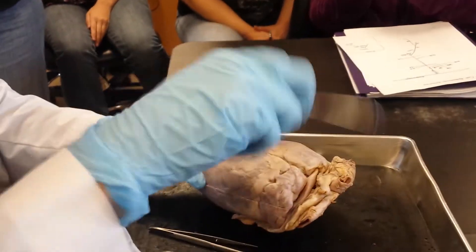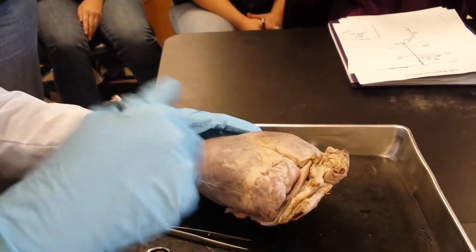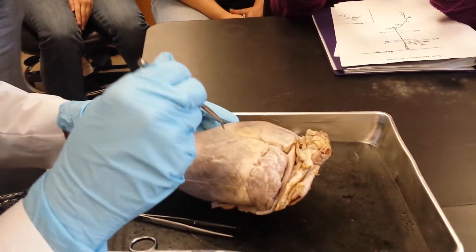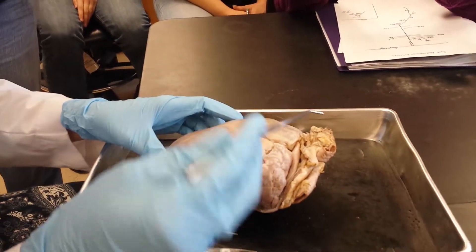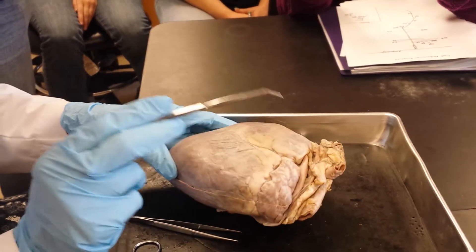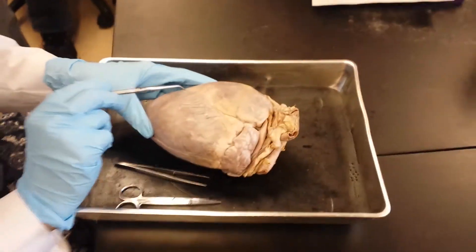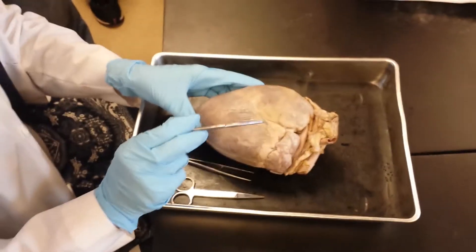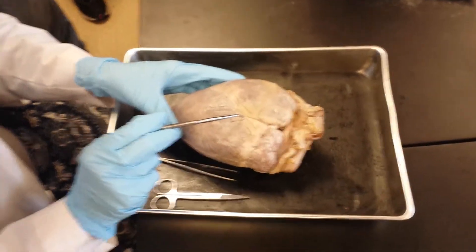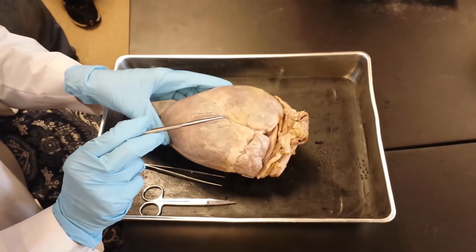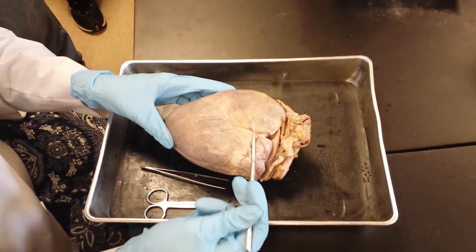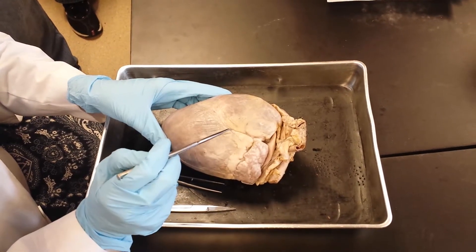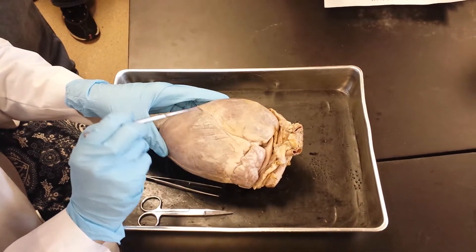We're going to do the external anatomy of the heart first and then we'll go to the inside. Looking at the front — this is the anterior. The very first thing you see across the front is this diagonal line. That's the anterior interventricular sulcus. Sulcus is a groove, and since it's on the anterior side or the front, we call it the anterior interventricular sulcus.